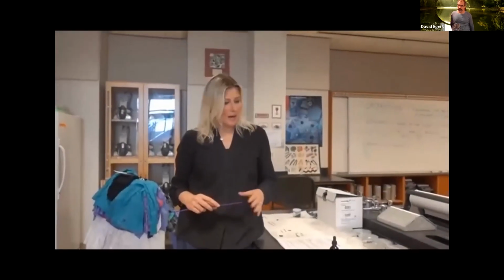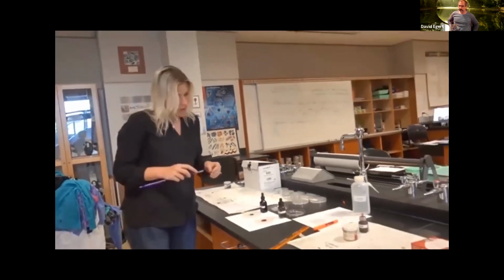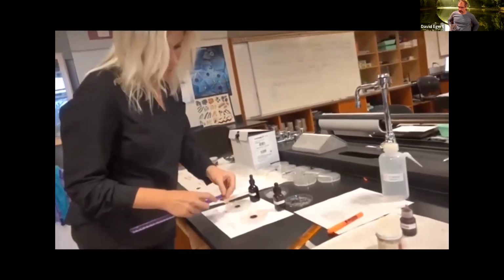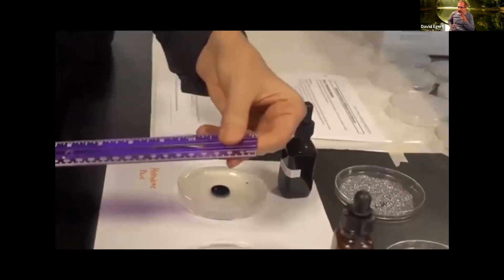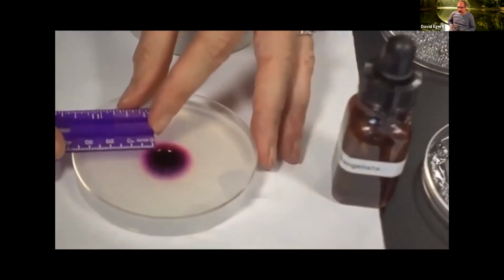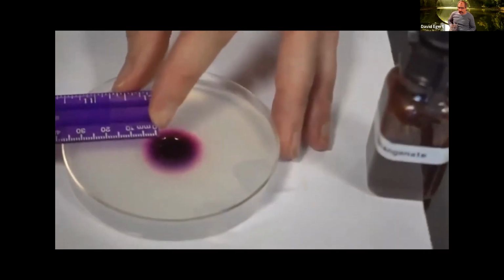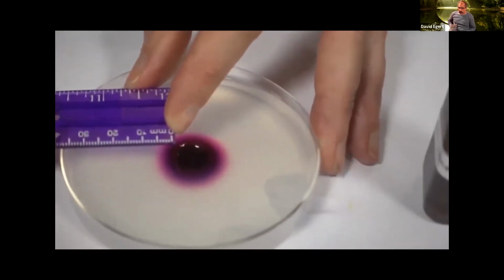Okay, so I'm back here at our diffusion experiment, and it's been a half hour, so it's time for us to measure how far the dyes have diffused away from the well edge. If I start here with the potassium permanganate, I will use the metric side of this ruler, and we're going to measure it in millimeters. I'll line the 0 mark with the edge, and then I'm going to read the very edge here.